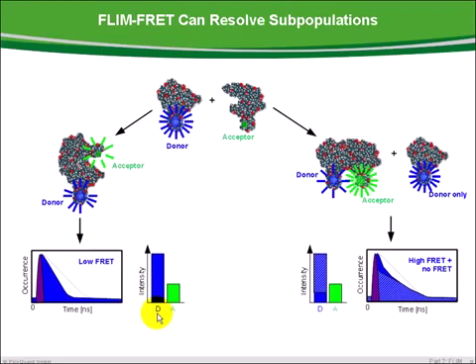However, in the TC-SPC histogram, both cases show a different pattern. With lifetime FRET, we can therefore evaluate the FRET efficiency of the bound population and the fraction of the bound to unbound molecules.